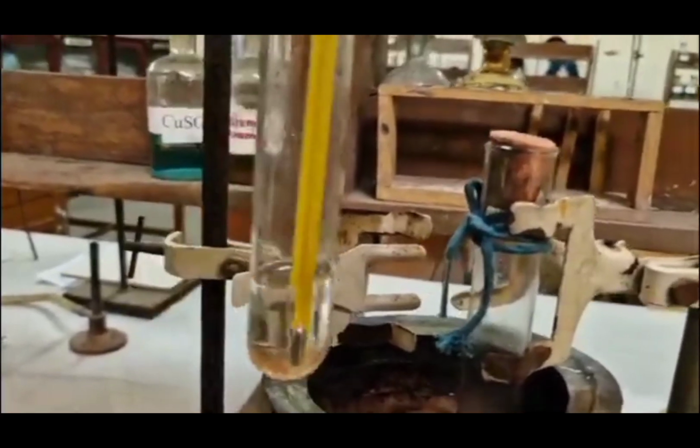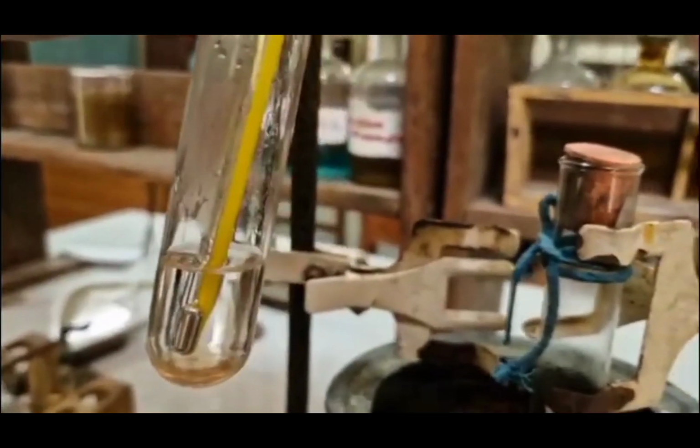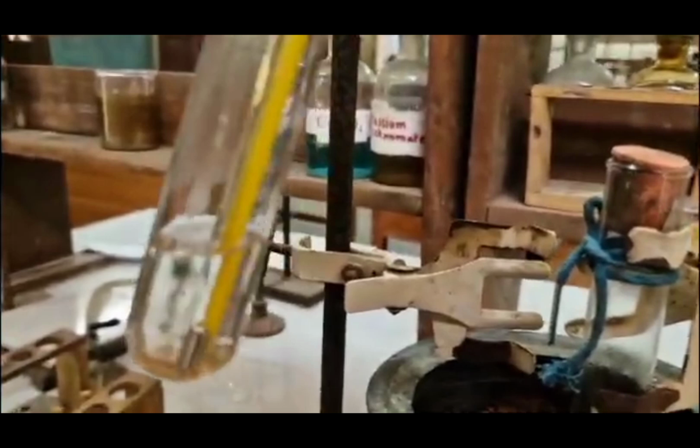Here we can see two layers. It means turbidity disappears when we cannot see the two layers separately. We will note down when turbidity appears.